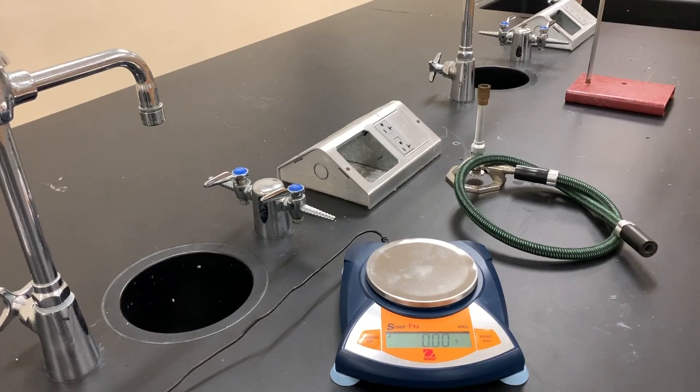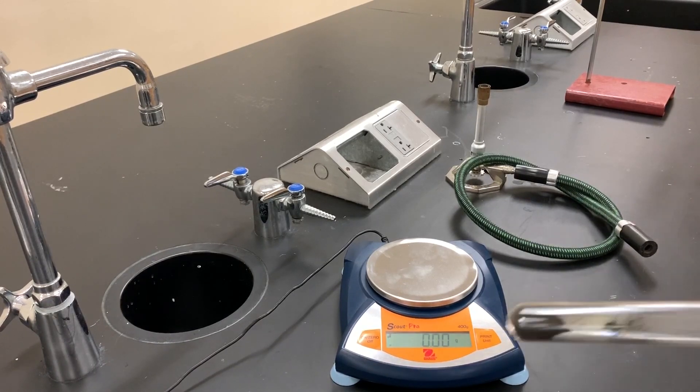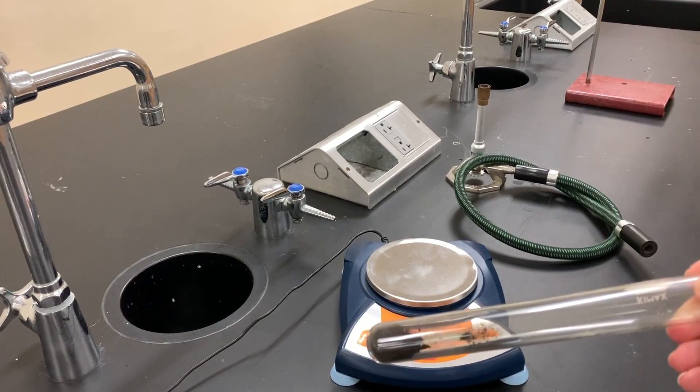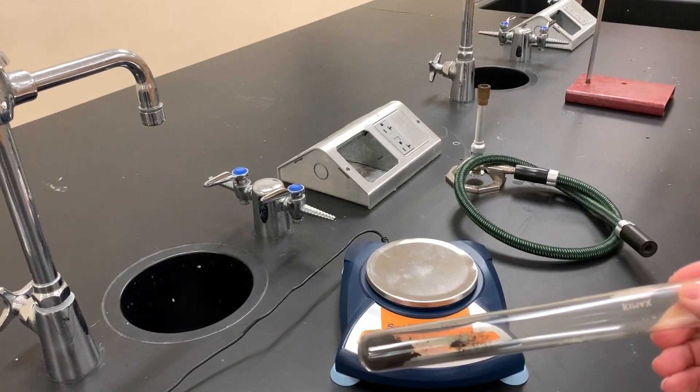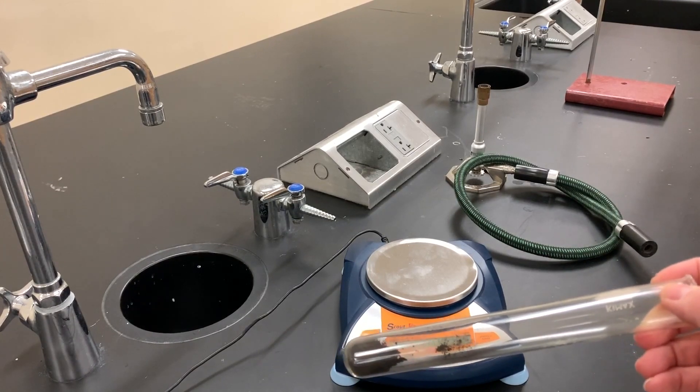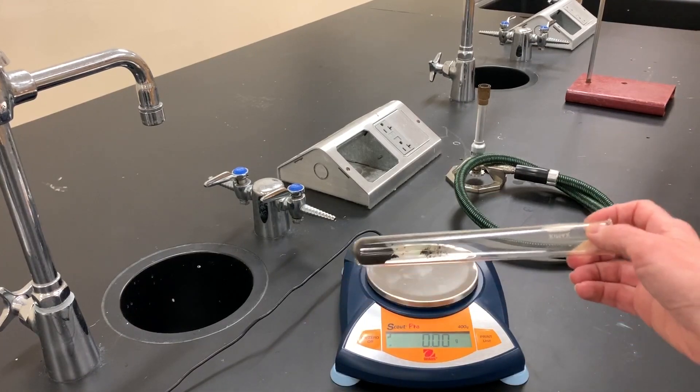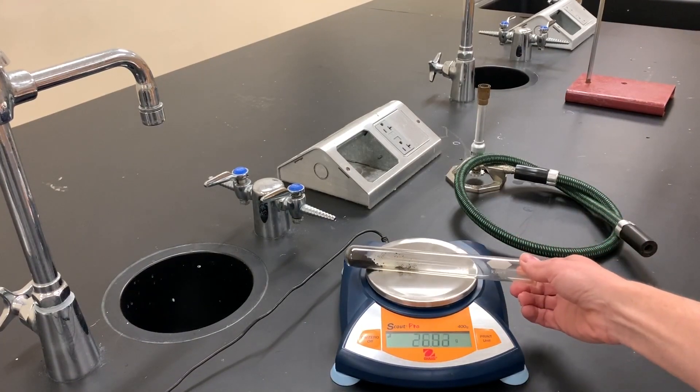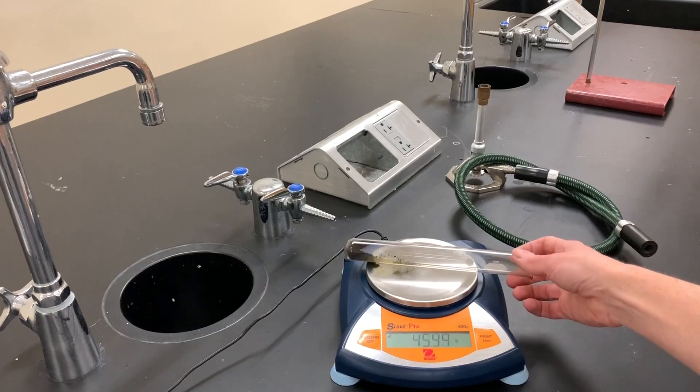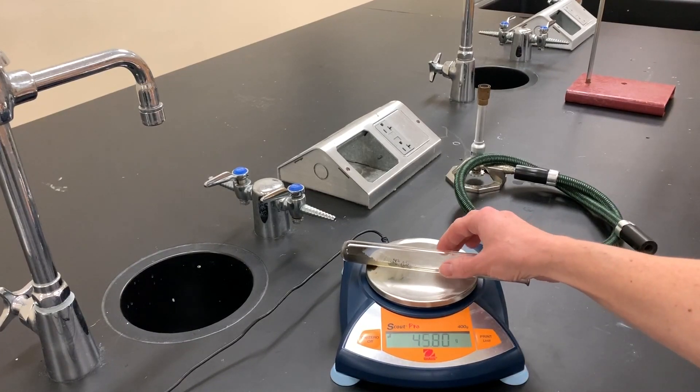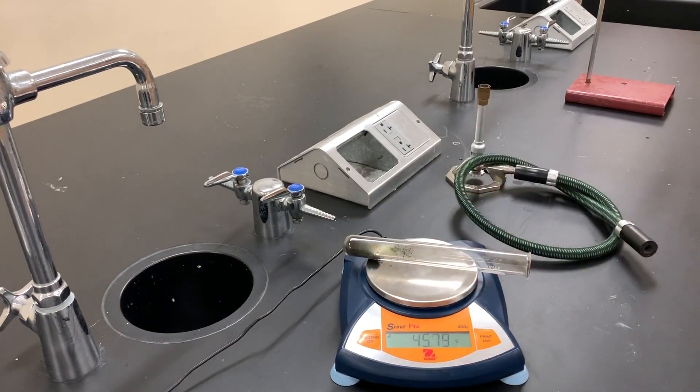Using that same electronic balance, have it on zero and gently place your very cooled test tube. Make sure it's not warm at all because that will give you an error reading on the mass. You should see that the mass has gone down because we've driven off carbon dioxide.